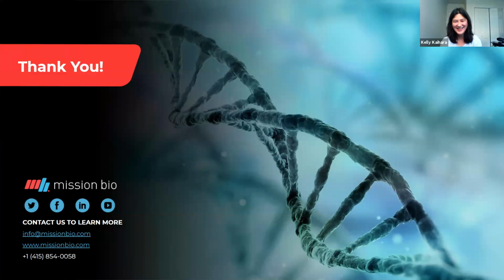Yes, you can. Hannah showed the beautiful scatter plot, so you can see differences in expression levels between your different populations. We didn't show it on this webinar, but in the violin plots, we showed you what it looked like looking at different DNA parameters, but you can also look at your protein expression via the violin plots.